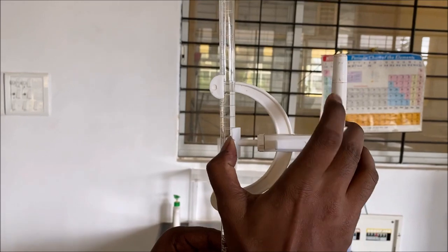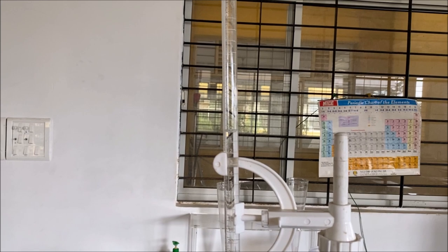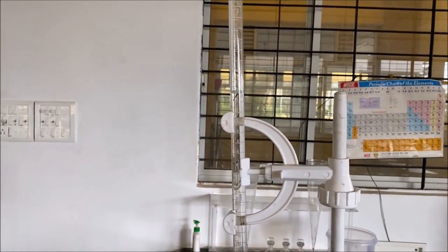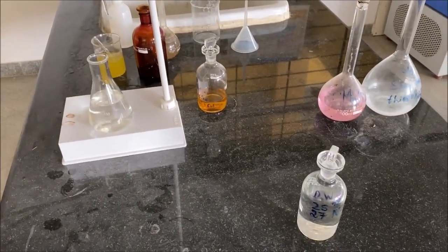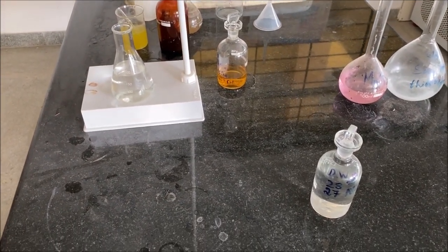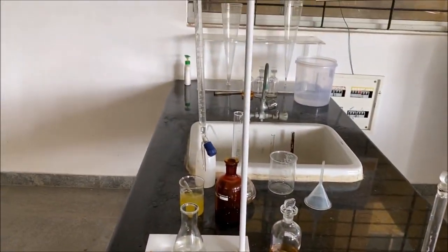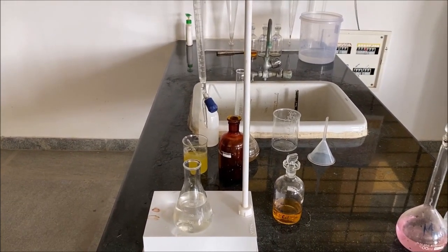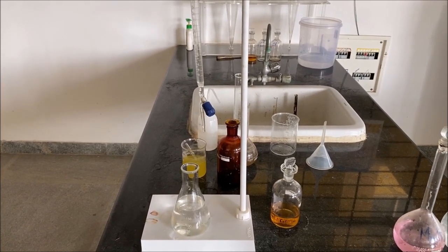At this point, we are going to note down the burette readings and do the calculation for dissolved oxygen for the two BOD bottles which were kept in the thermal chamber. You are supposed to use this calculation for determination of biochemical oxygen demand, considering it with respect to the previous calculation and utilizing the formula available in the lab manual for the calculation of biochemical oxygen demand.